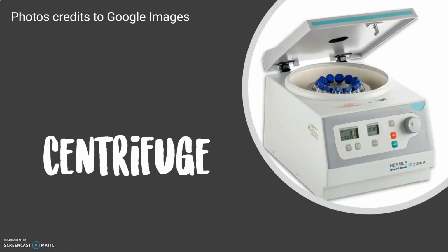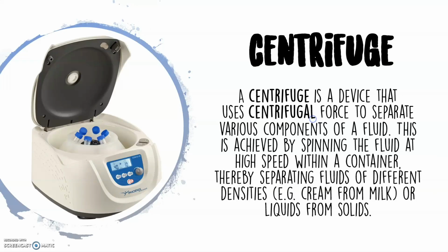Now, let us proceed with the centrifuge. Remember that the centrifuge is the device used in the research method called centrifugation. This is used when you separate mixtures through spinning.